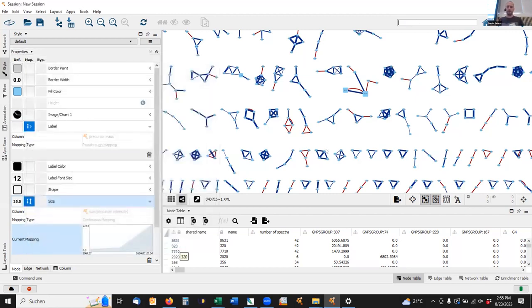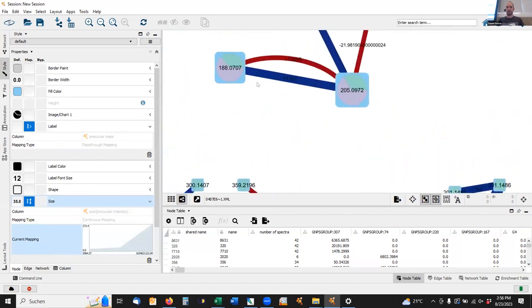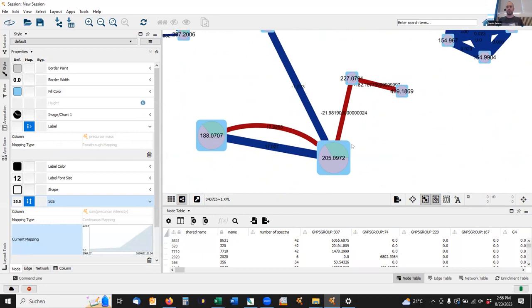And then I can visualize the average intensities in there. And now if we zoom in, you will see that pie charts now appear on your network. And then I can quickly see that some of those nodes have only one color in the pie chart. So they may come either from the serum or from the skin. And some others are present in both, right? So obviously this is super simple, but you can play around with it and eventually use more categories or different categories.